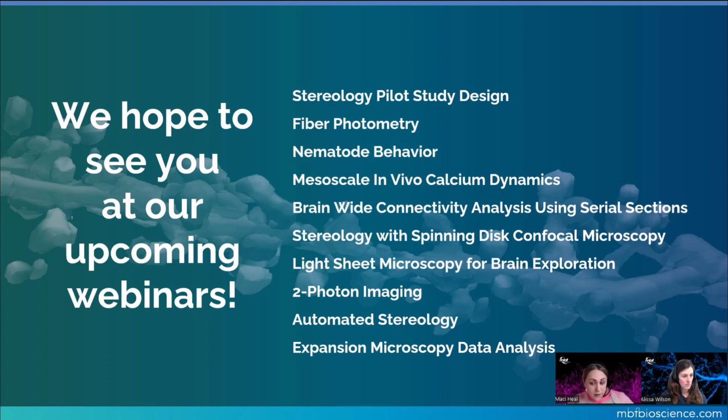Also, another BrainMaker question about using BrainMaker on serial sections that have been Z-stacked on a confocal microscope. There are two parts to the question, depending on whether BrainMaker itself will do the stacking of those serial sections. NeuroInfo, however, as BrainMaker is part of that, will work on serial sections that have been realigned into a Z-stack, so you can do all of your atlas registration there.